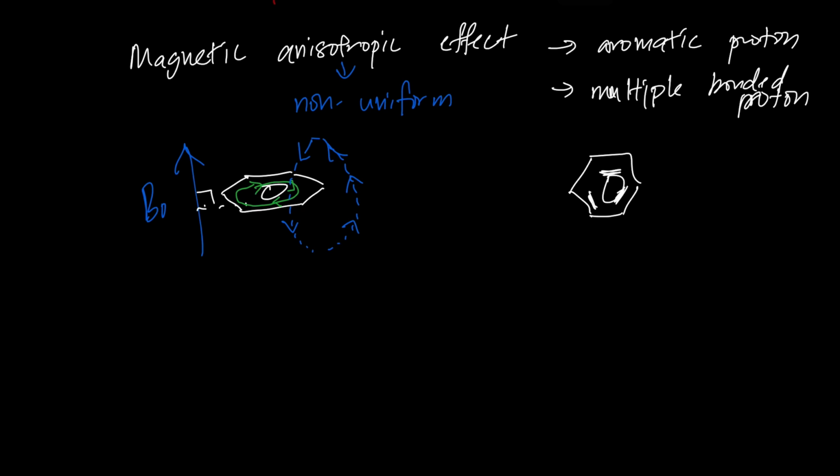So you have this secondary magnetic field in this direction. Try to imagine that you have an aromatic proton.